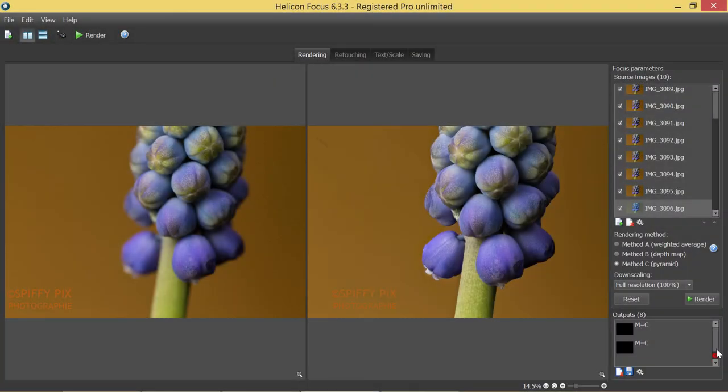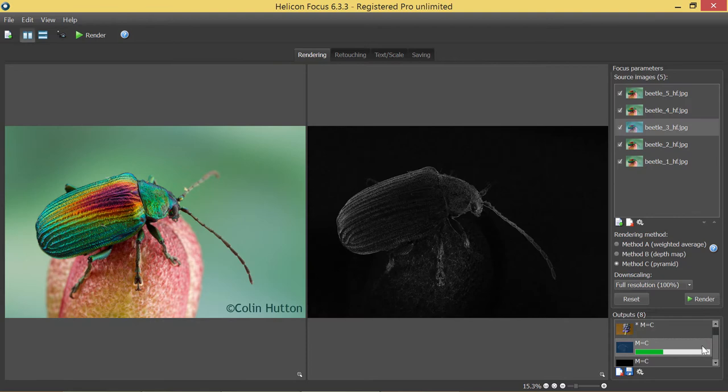Welcome to HeliconSoft video tutorials. This time we will talk about advanced functionality of HeliconFocus, forming queues of stacks and automated stack splitting.